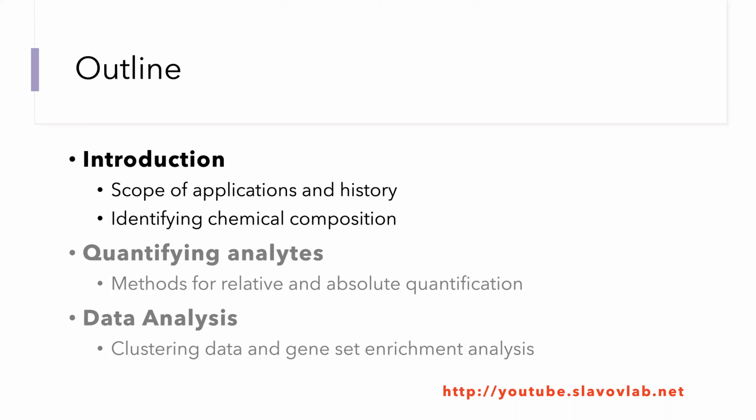In the third lecture, I will summarize some frequently used methods for exploring data and doing basic analysis, such as clustering and gene set enrichment analysis. If you're interested in learning more about advanced applications of mass spectrometry, you can find a number of recorded videos from the URL listed at the bottom right of this slide.